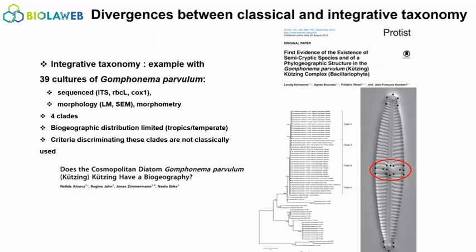And the colleagues of Berlin, in fact, described species based on the same kind of data, and these species are also very difficult to identify purely on morphology. Okay, do you understand what I mean? And do you see also what can be the impact on the floristic list that we can produce with metabarcoding and with microscopy? Okay, so you understand.